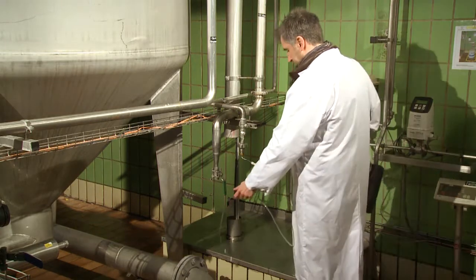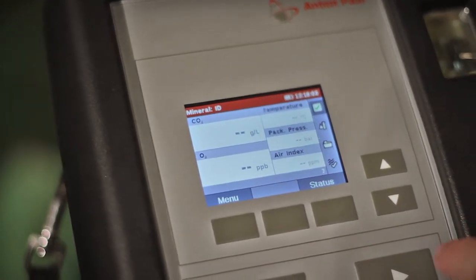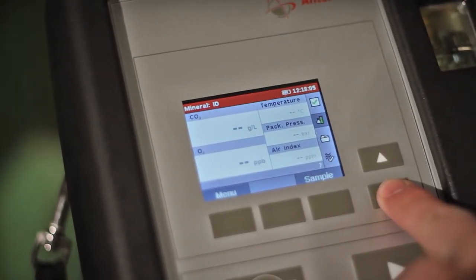Anton Paar's CO2 and O2 meters are supplied factory adjusted and can be used immediately. You can start a measurement after a few short steps only.